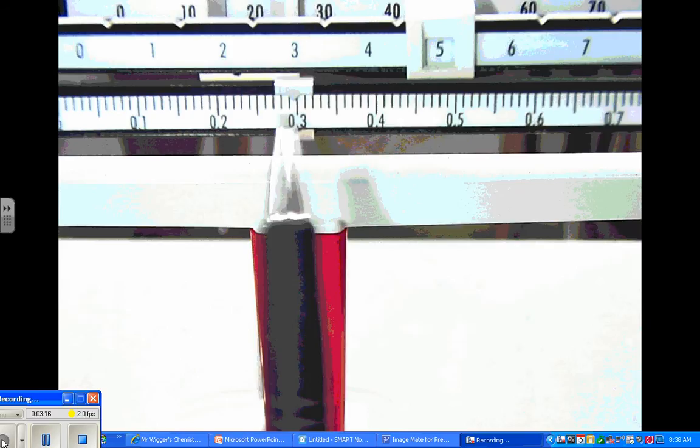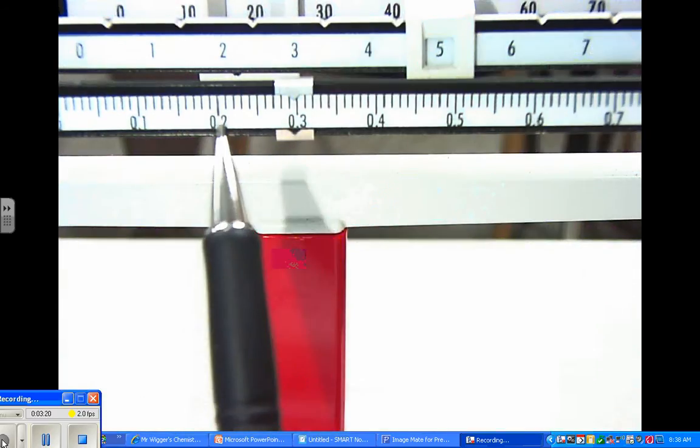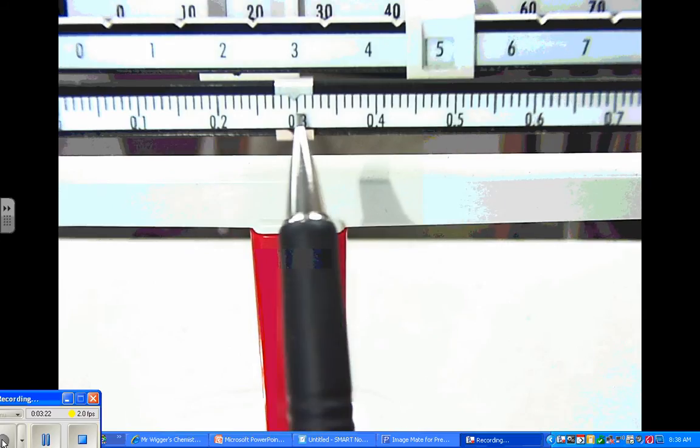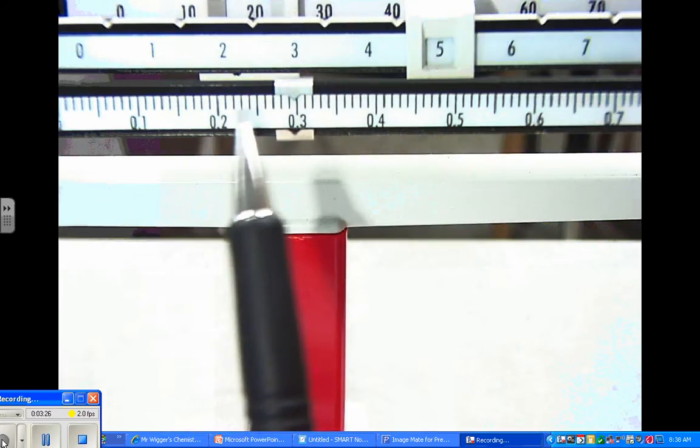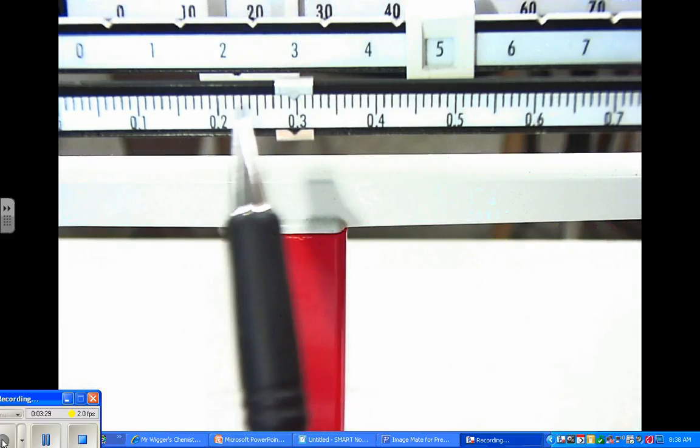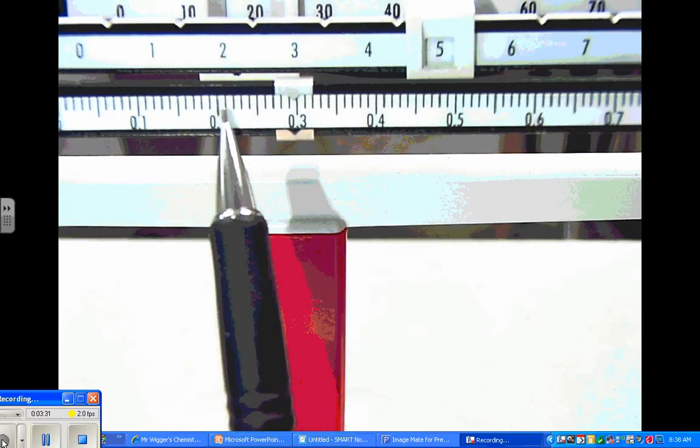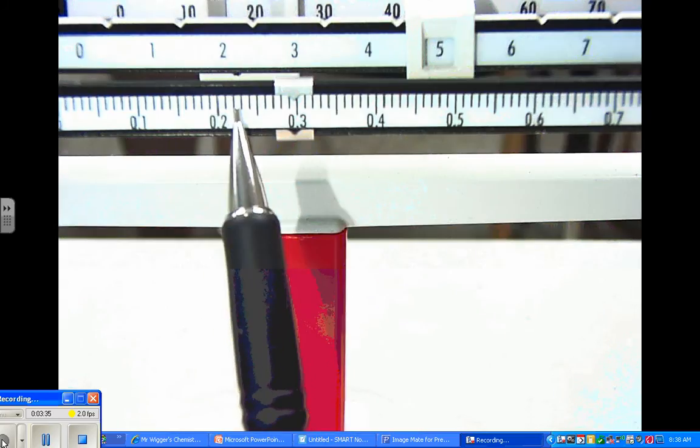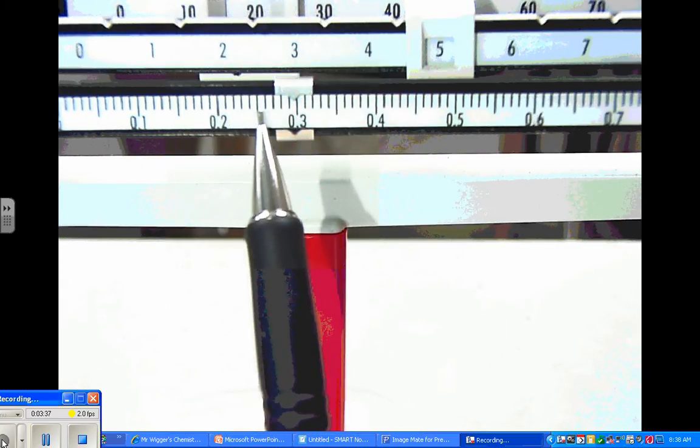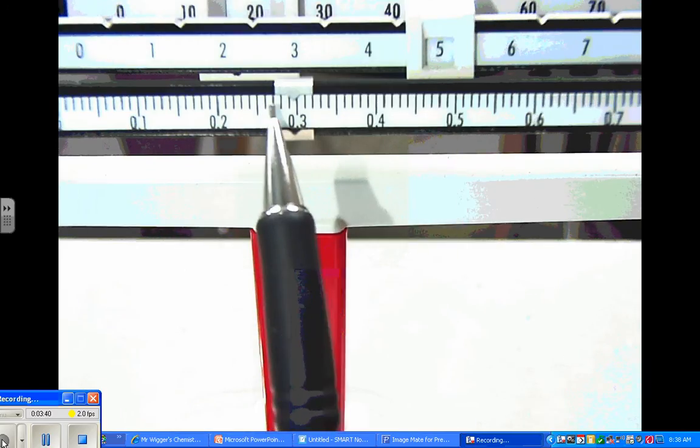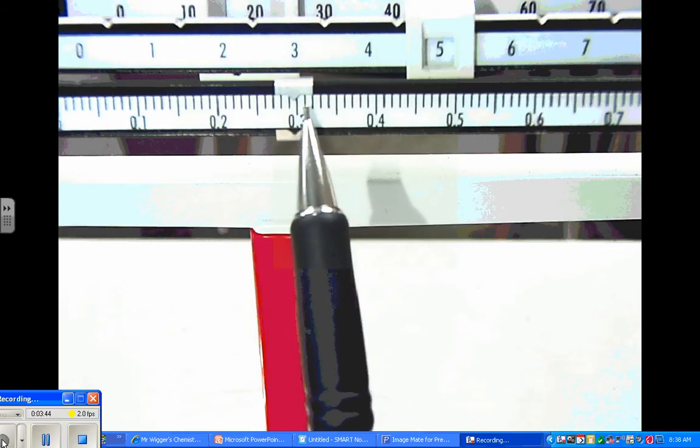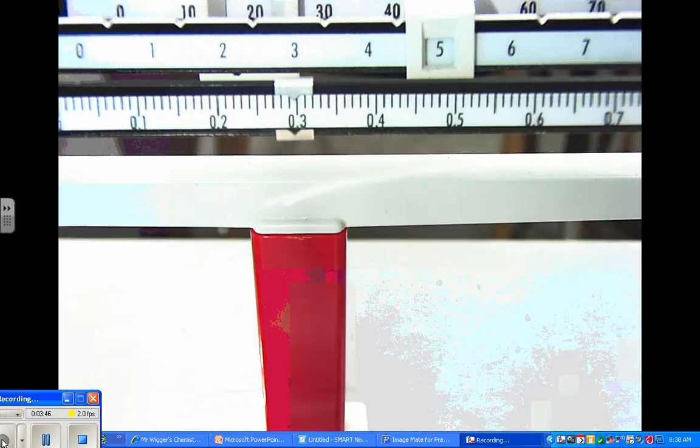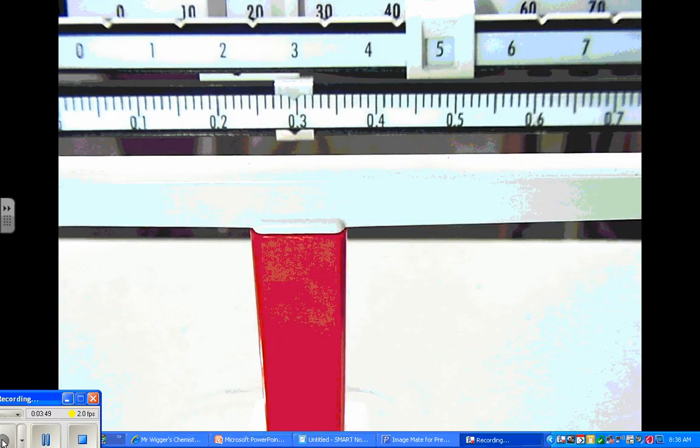Okay. For what you're looking at, you can see that this guy has set a position that's between these two lines. It's between two lines. So this is 0.2 and this is 0.3. And between them is ten lines. So each of those lines is 0.01. So I have 0.21, 0.22, 0.23, 0.24, 0.25, 0.26, 0.27, 0.28, 0.29. And when I get here, I'm at 0.3. But I'm not at 3, am I? I'm a little bit off to the left of it.